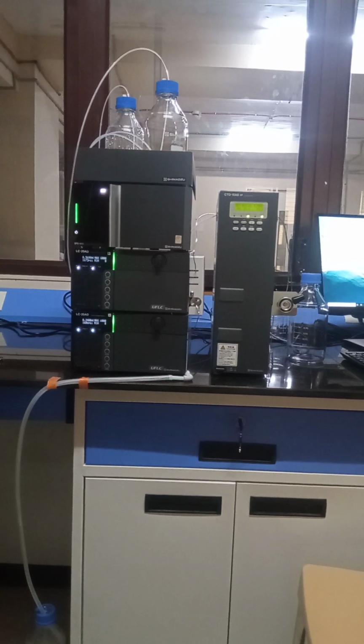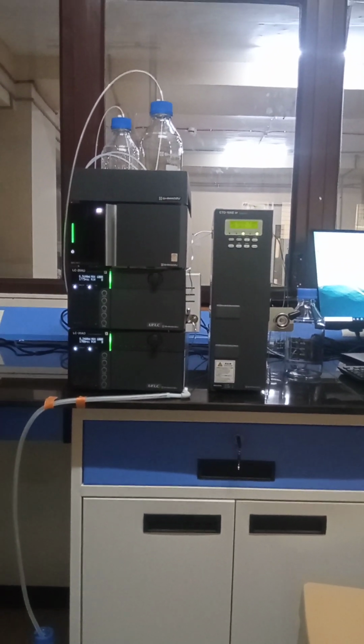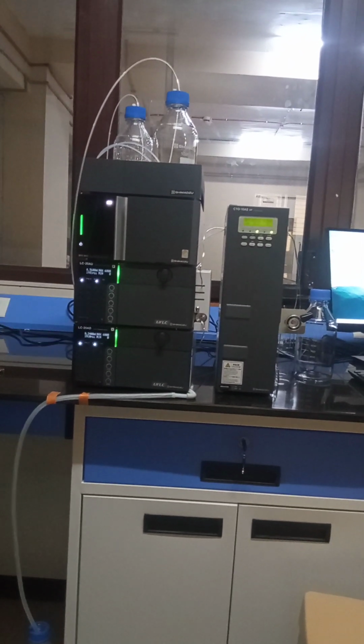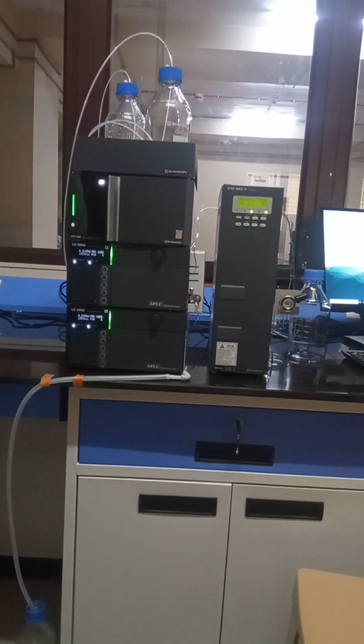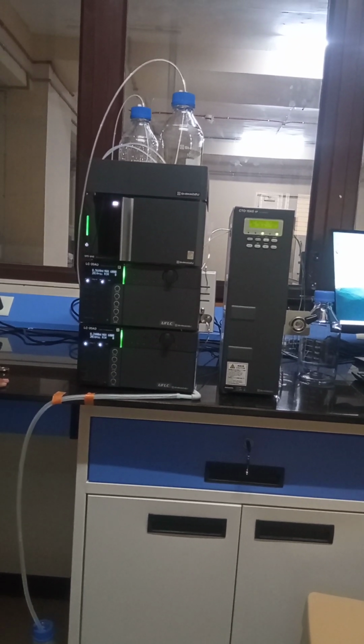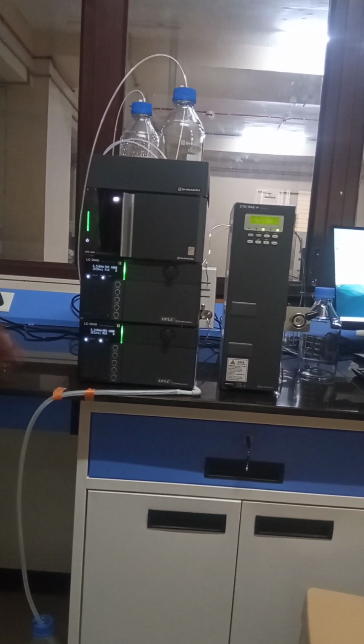After 5 to 10 minutes, if any leakage is there, check all modules. Unfortunately, it may leak, or 100% it won't leak. Before starting, you have to look one time. Any leakage is there, check all modules.